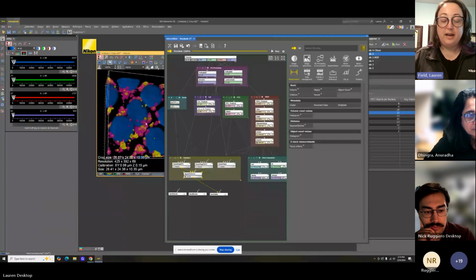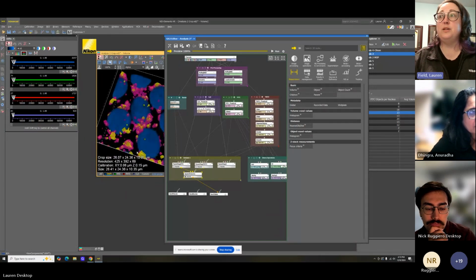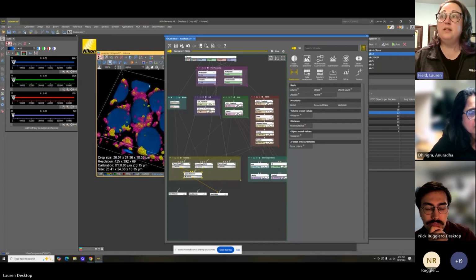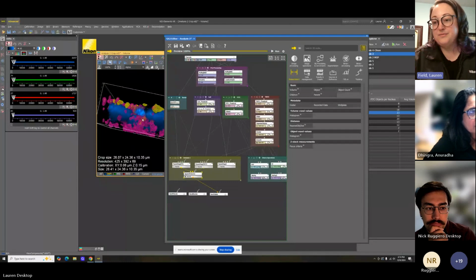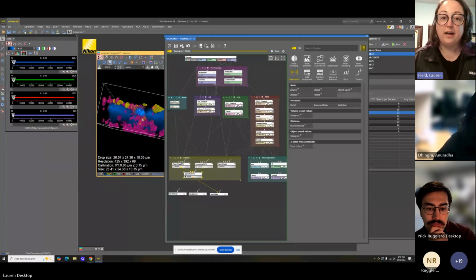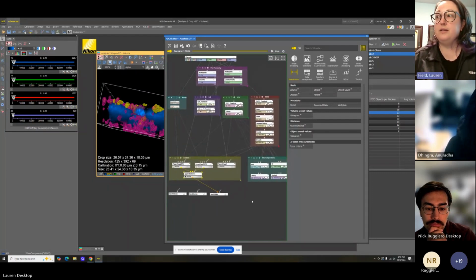Again, you guys don't technically have this 3-dimensional render yet. I know that was a hope and plan for the future, because it is great for these confocal pictures to deal with this stuff. When you do a max intensity projection, a lot of this volume information, where there might actually be two structures in this pink, might get smushed together. It's one of those things you want to think about for long-term processing. Are there any questions about this before I have to run, and I will let Nick take over again?